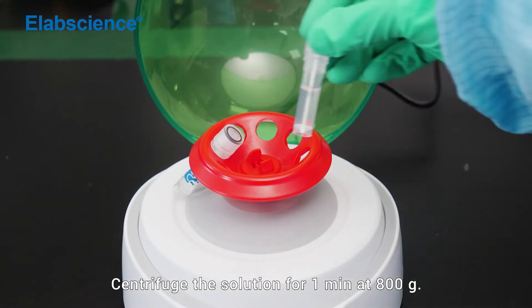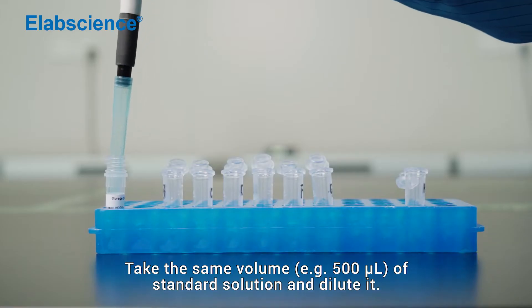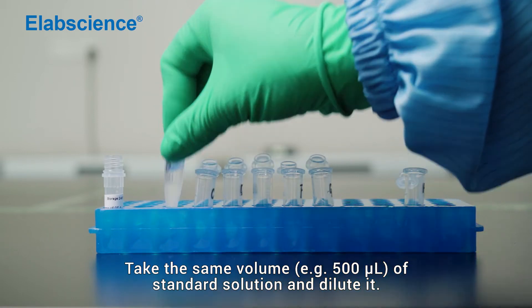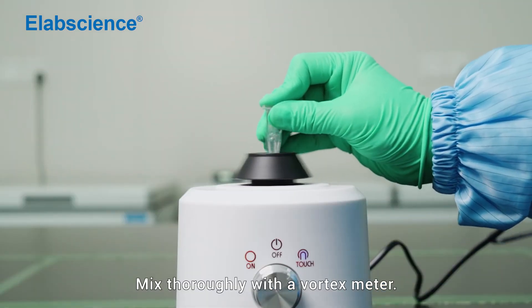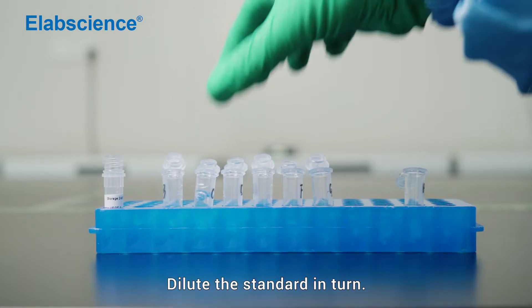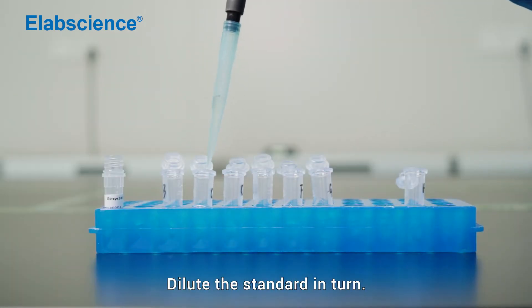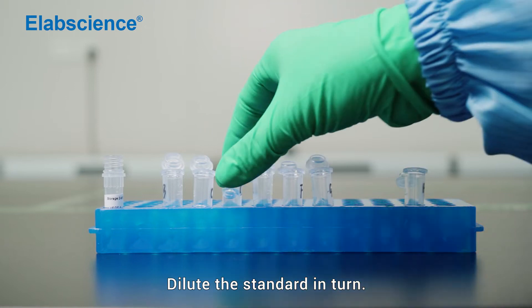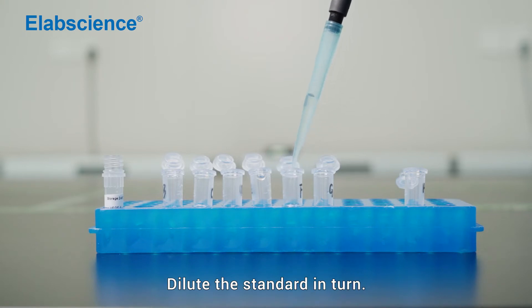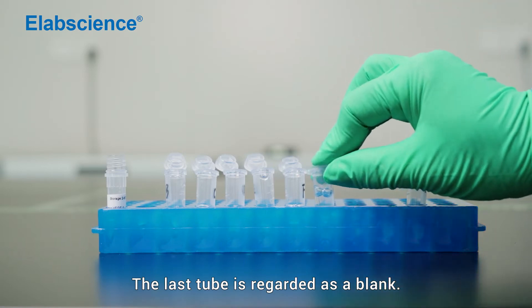Centrifuge the solution for 1 minute at 800 times gravity. Take the same volume of standard solution and dilute it. Mix thoroughly with a vortex mixer. Dilute the standard in turn. The last tube is regarded as a blank.